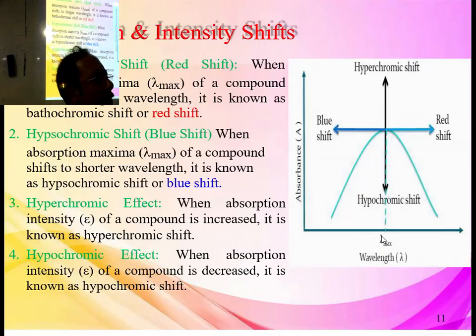So particularly this ultraviolet spectroscopy is utilized to find out impurity in a drug sample, medicine. Presence of impurity in the drug sample. Nowadays we know contaminated drugs are very common in the market. We sometimes go for alternative drugs, cheaper medicine like Platinum RX, that company, they are claiming that they are giving it at a cheaper price.